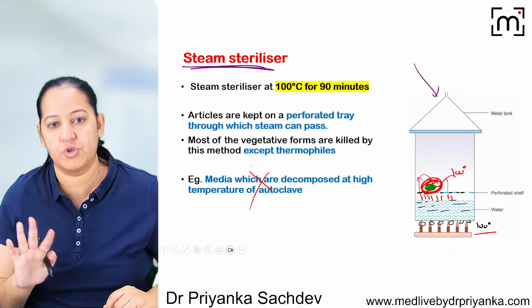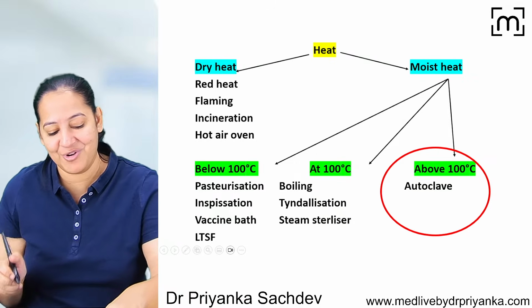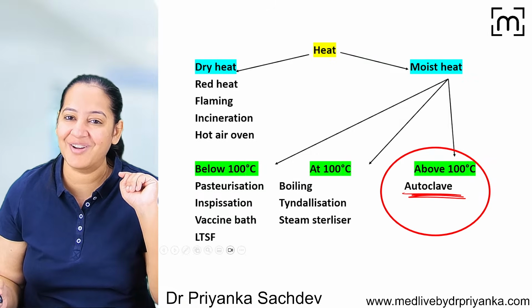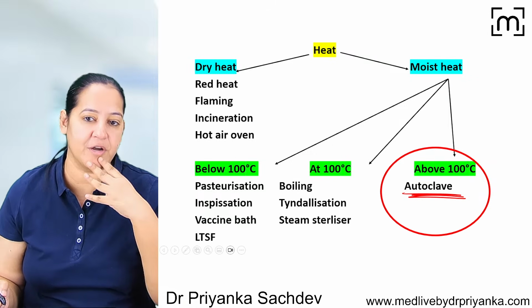Okay, not very useful, but you should know that. Steam sterilization. Now, the ultra important, super duper important method is the autoclave.